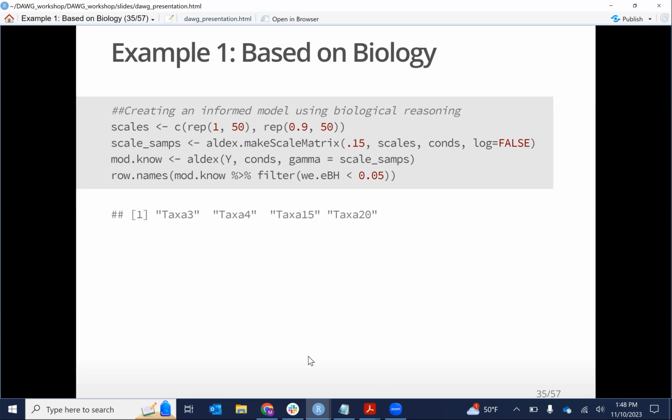Yeah, so if you were running this in real life, you could use flow cytometry on bacterial cells to get an absolute count of the cells in the sample. Yep. And if that is reflective of what question you're asking, then you absolutely can use it. Okay. Right. Could you use qPCR for 16S? If it's reflective of what question you're asking. Justin will tell you, and you know, Justin, that there's all sorts of potential subtle mismatches maybe between some of these outside measurements and questions you're asking.